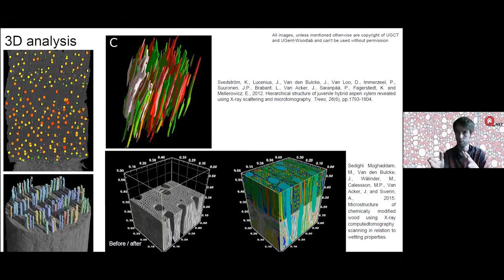And I write that before after, because you can take the same sample, you scan it at a very high resolution, and then you're going to subject that same sample to any kind of wood treatment. In this case, they were interested in a certain chemical modification and how it impacted not only if there were certain vessels blocked or filled, like bulking of the material, which is a typical wood treatment, but also whether or not it impacted cell wall dimensions. So, instead of measuring 100 samples, you could compare the same sample before and after. So this is actually an intricate feature of CT, and that's why you really can adhere to the 3D data set and the 3D image analysis as well. Next slide, please, Giulia.